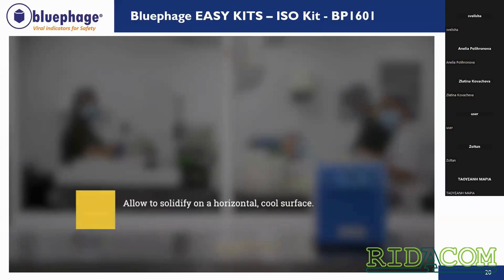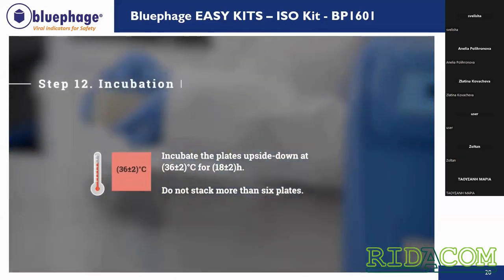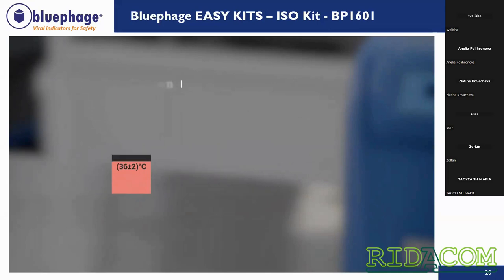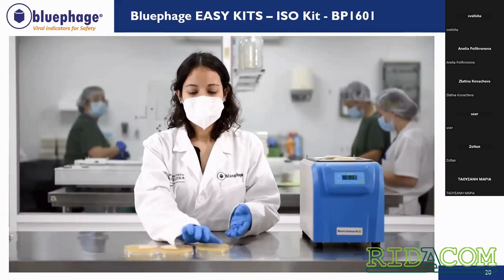Once that has been solidified in the cool surface, we will put in an incubator. And the incubation is performed at 36 degrees for 18 hours. It's important to not stack more than 6 plates, and the incubation must be performed upside down. So after the incubation time, we will have our plates.